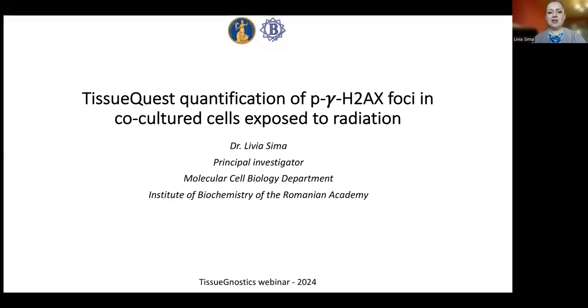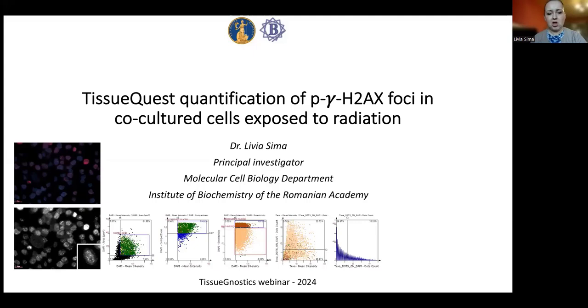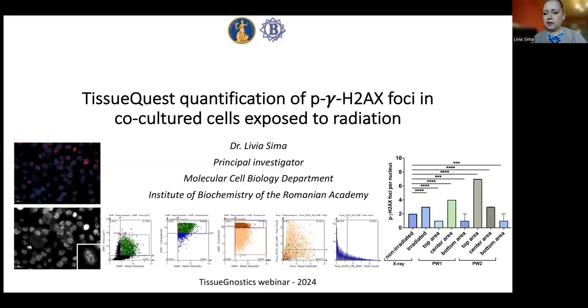Hi, Carly. It's very nice for me to have the opportunity to present some of our TissueFAXS applications to the main users. Today, I will present the quantification of phospho-γH2AX foci in co-cultures of cells exposed to flash radiation. And for this, I will make a step-by-step presentation from the initial observation of a phenotype of DNA damage in melanoma cancer cells to step-by-step instructions on how to do the gating strategy and perform the image segmentation to obtain, finally, data that can be analyzed statistically.